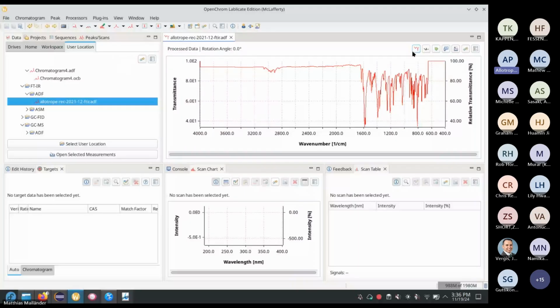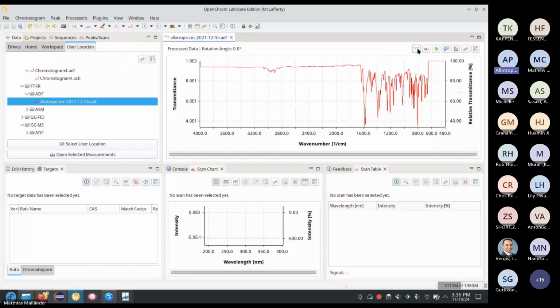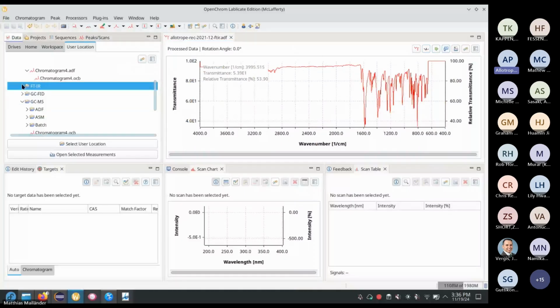instruments in there. So there's also basic support for it, like we can look at the absorption spectrum, the transmission spectrum, and because the Allotrope data format is pretty cool, we can also look at the raw data. I think very few data standards are that great in this regard. So again, it behaves just like a vendor format in here. So it's super great. So okay, we already have spectroscopy somewhat included in here.